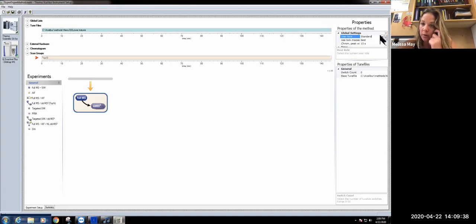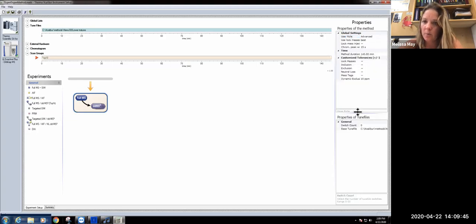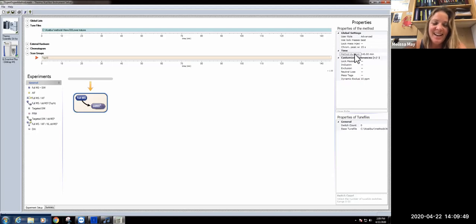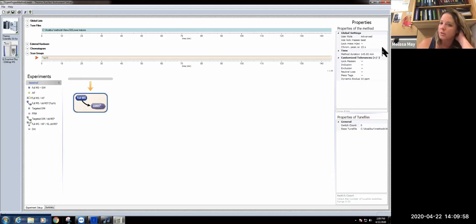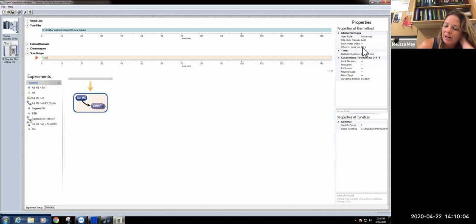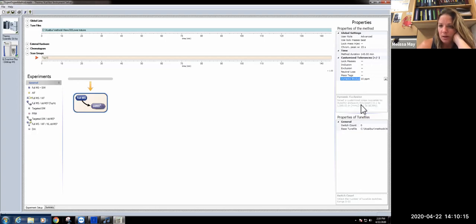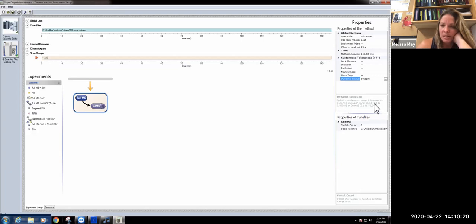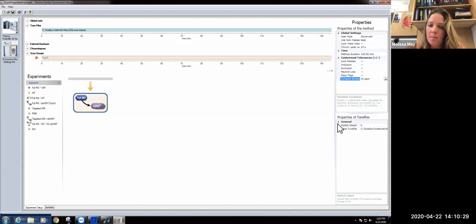If we go into our advanced user role, we have our MS method duration matching with our LC so that it's collecting and scanning data the entire time that we have samples coming in. The best lock masses and chromatographic peak width of 15 seconds are just defaults. Then we use the dynamic exclusion, which is basically a max tolerance for your M over Z so that when you're sampling, you're spacing things out.